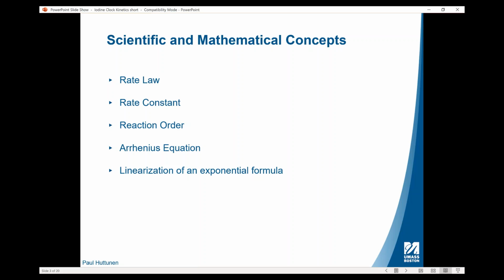Okay, so today's lab does have quite a few mathematical concepts in it. So we are going to go through rate laws, rate constants, and reaction orders. We are also going to discuss the Arrhenius equation and linearization of an exponential formula. So we will be using a little bit of pre-calculus today.